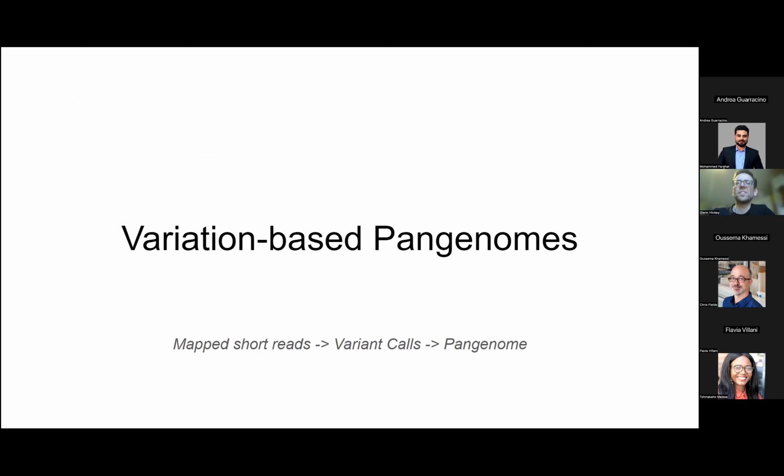Next slide. So that'll lead us into the variation-based pangenomes. This is going from short reads to variant calls, like you have in the 1000 Genomes, so variant calls in a VCF, and making a pangenome from that.